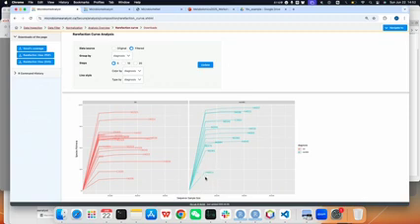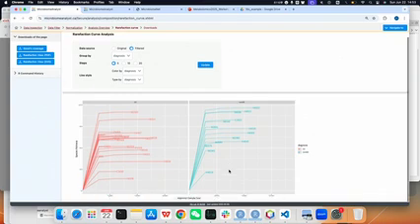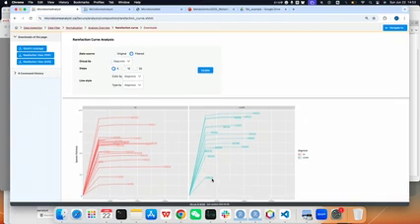It seems not sequenced well, and you can go back to the normalization page to do a rarefy, but this is not mandatory, because sometimes if you do the rarefy, we lose some information because we subsample. In this case, because we have only this one sample that is not quite satisfactory, we keep it like this.